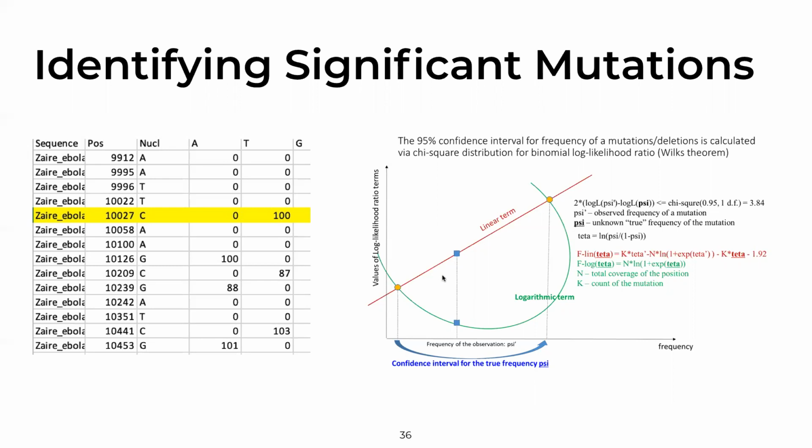And then it's not only, well, for annotation, of course it is significant. For annotation, first of all, do not just consider the depth, let's say of 20 in this particular region. You're also considering, well, how is it distributed across the whole exome? And that has to do with just the total coverage for your file. So those are some technical questions that are very good, but I think you also need to consider the larger context of what is the sample and what are we talking about?